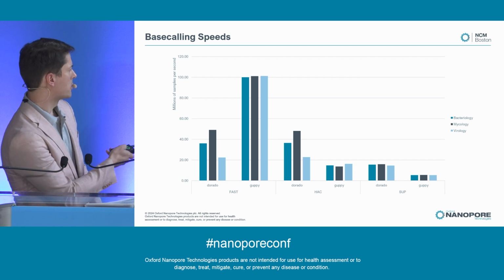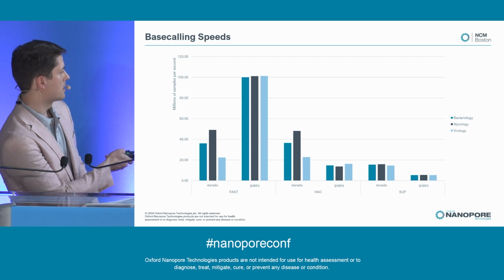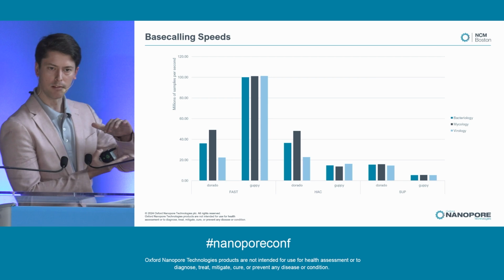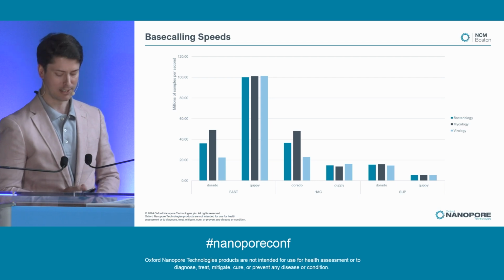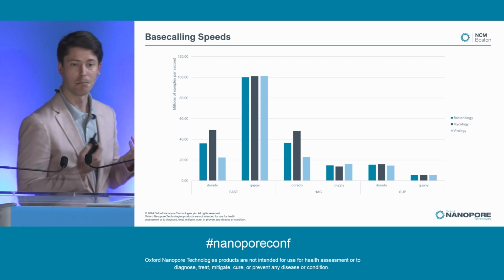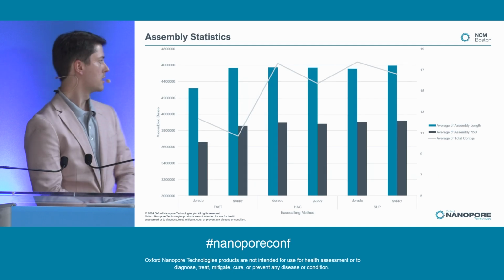And real quickly, it does seem interesting that, in my opinion anyway, as you increase the accuracy, the effect of the different collections seems to wane a little bit. Now, we've got a smaller sample size for everything that isn't bacteria, so it remains to be seen as we continue to sequence. But I just wanted to highlight that because sooner or later that may become very interesting. Okay, so on to the assemblies.